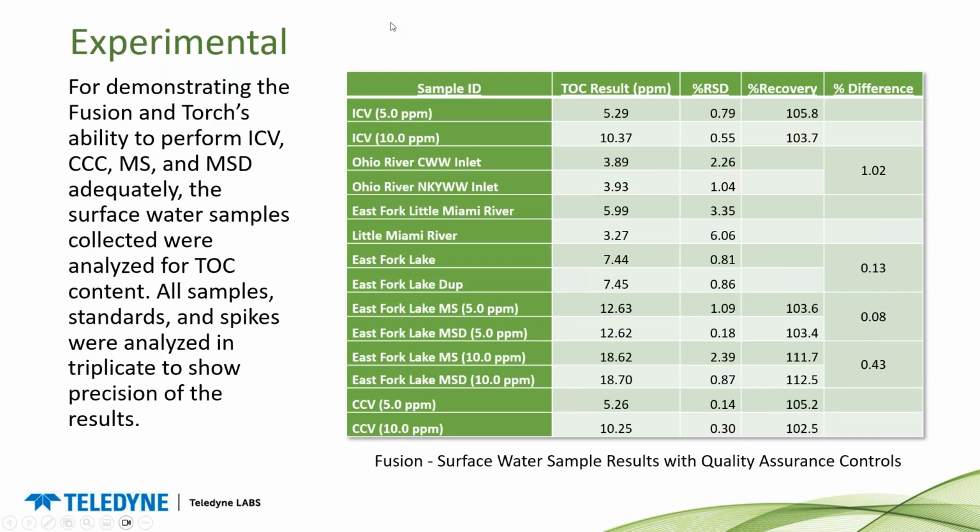Here are the results from the Fusion instrument. So looking at the initial calibration verification, the percent recoveries are very accurate at 105 and 103%, and the RSDs are less than 1%, which indicates very, very good precision.